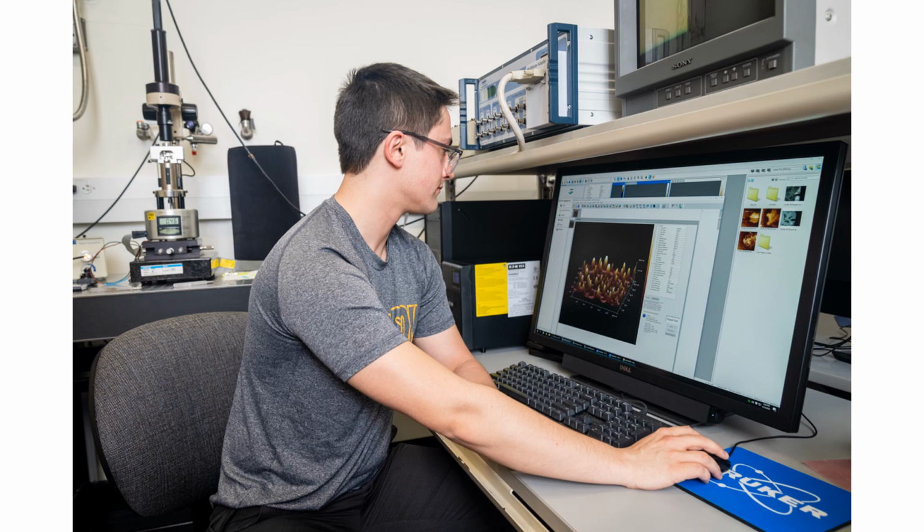So the AFM is able to produce an image of our sample surface, or the height of the atoms on the surface of our sample, by feeling the interacting forces between a very sharp probe and the actual atoms on the surface of our sample. And that occurs in this little region here.